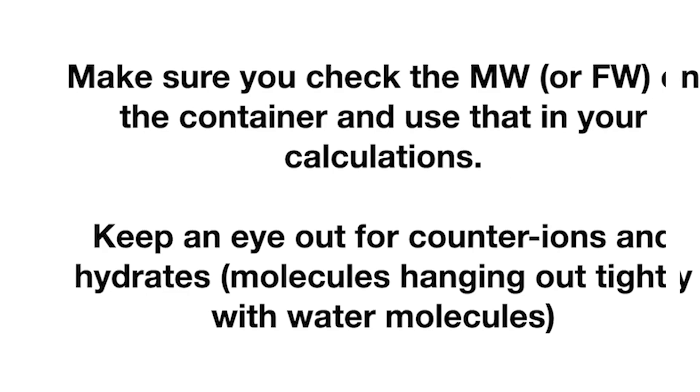Say you want to order some pizzas, and it's a really weird pizza place that charges you by weight. So you're trying to figure out how many pizzas to buy, so you take a pizza and you weigh it out, figure out how much one pizza weighs, multiply that by how many pizzas you want, and you place your order.